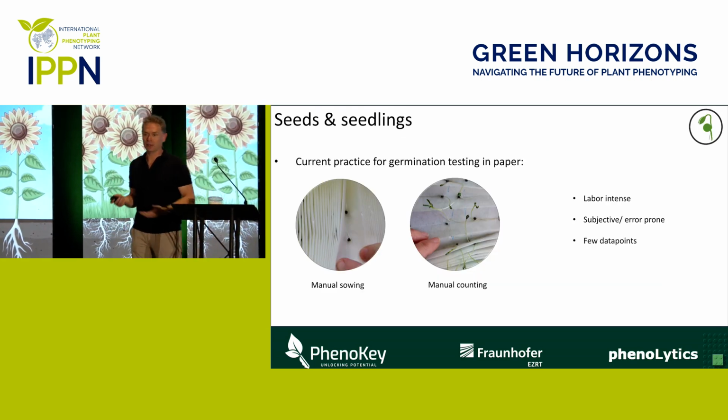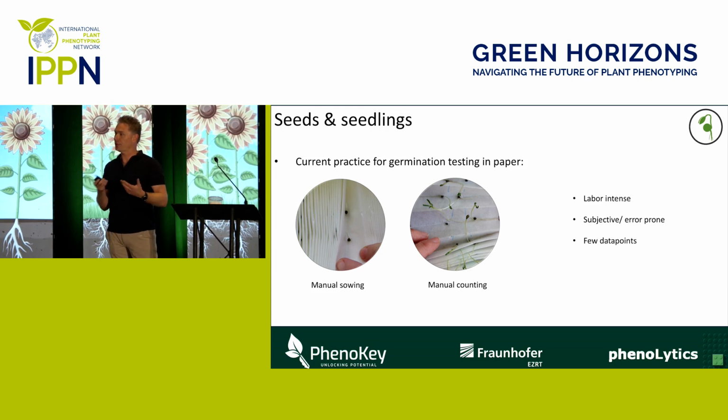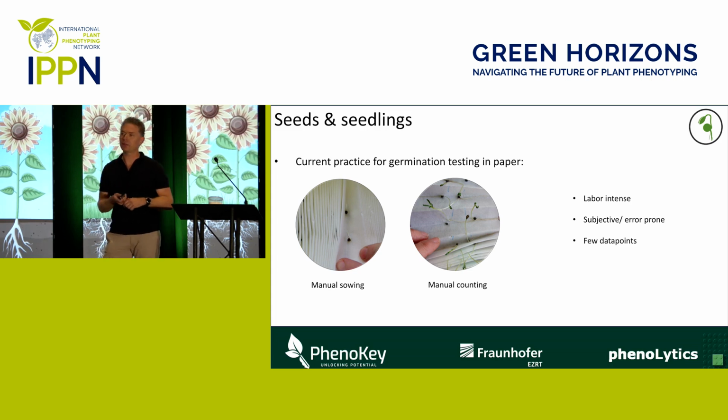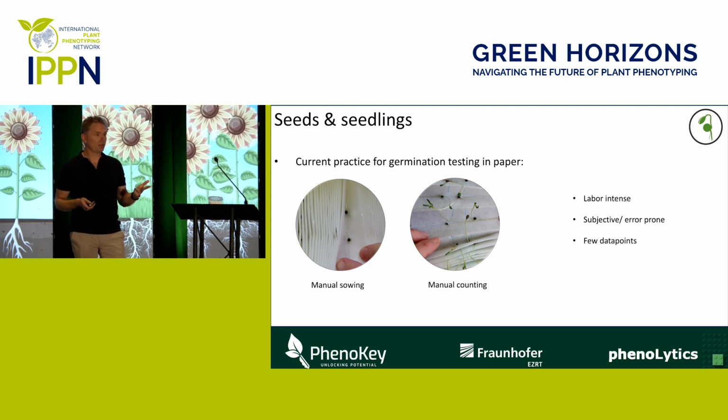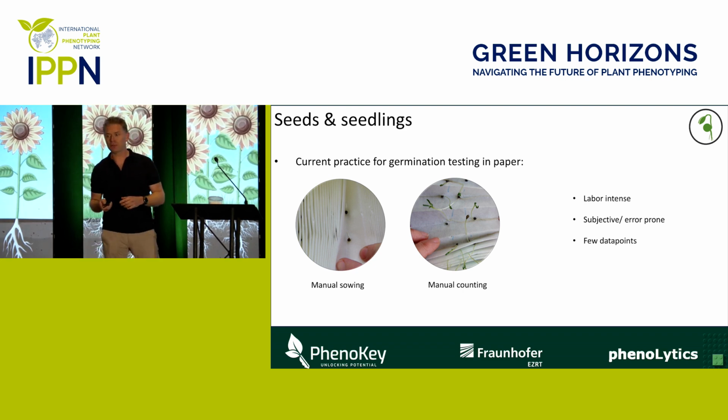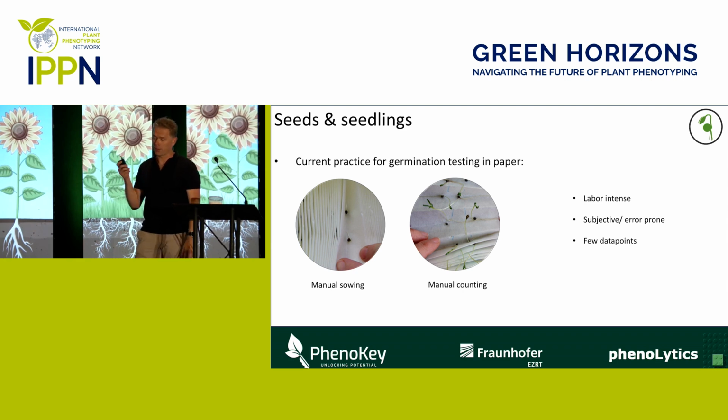Next up, germination testing. Probably you're all aware of germination testing that has to be conducted, sometimes in soil, sometimes in paper. And in many cases, the paper testing is the method that you have to use, and that's used in all companies. It's all manual, very labor intensive, all done by humans, so it's very subjective and prone to errors. And the result of a trial of 2 weeks with 400 seeds, with people doing all the work, is often not more than 4 or 8 data points. Germinated, not germinated, normal, abnormal, and maybe you do the counting twice. So very few data points for a significant amount of work.